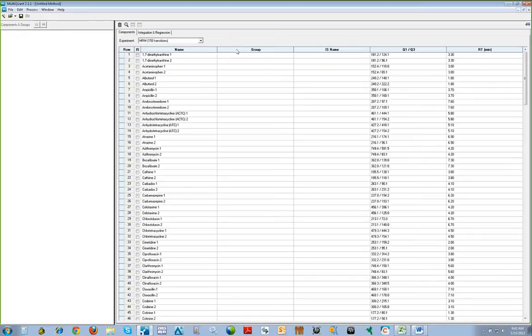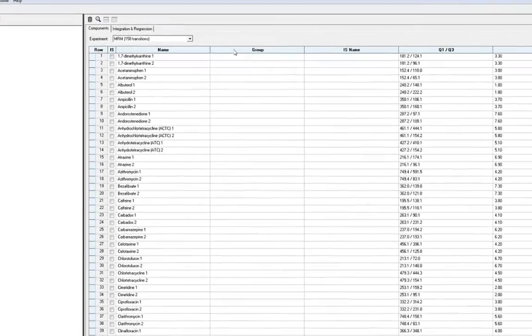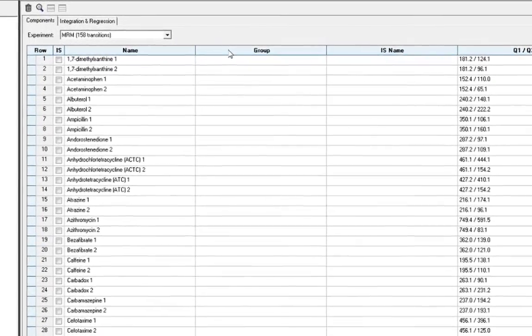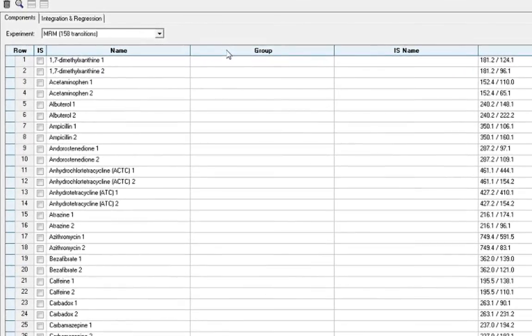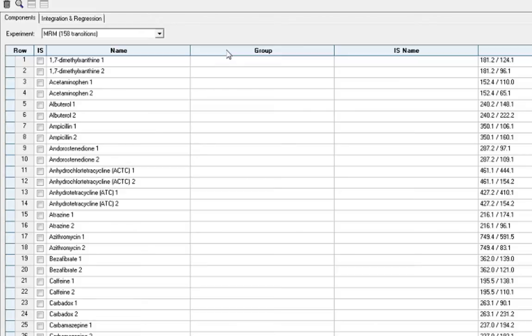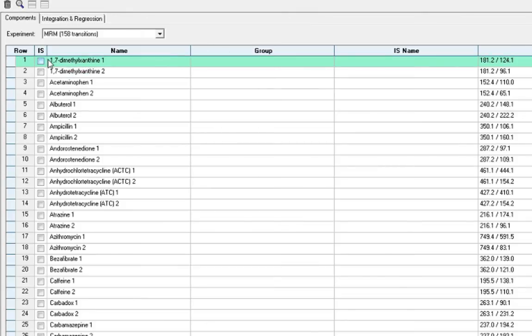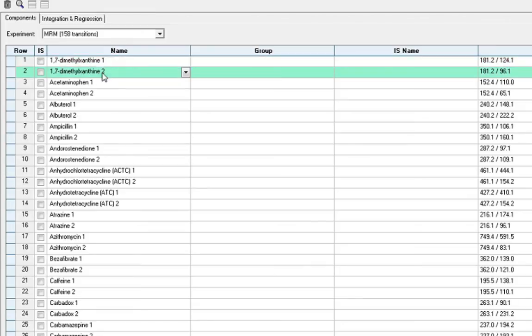We can also set up analyte groups here. The benefits of setting up analyte groups is to enable you to group multiple MRM transitions for a single compound for more efficient data review. Setting up groups can be easily done if you have your acquisition method created with your quantifier MRM transition identified as compound name 1 and your qualifier MRM transition identified as compound name 2 in sequential order as we do here.